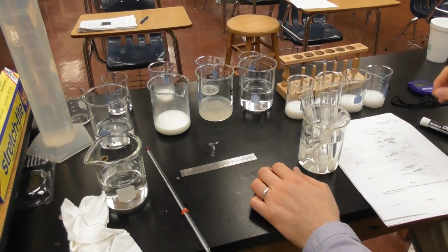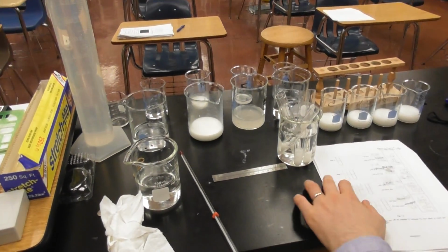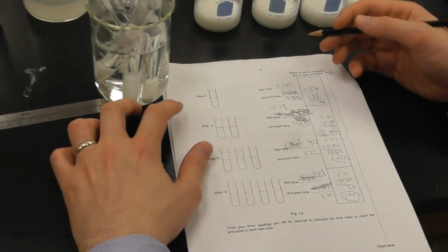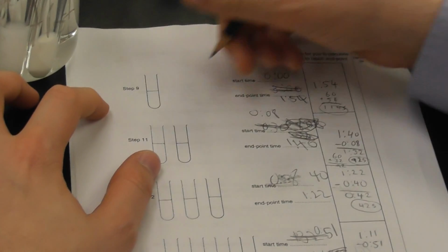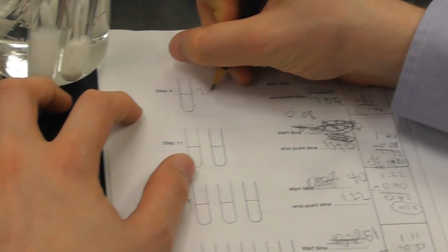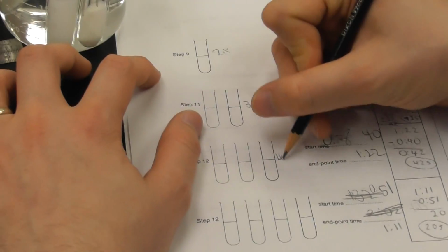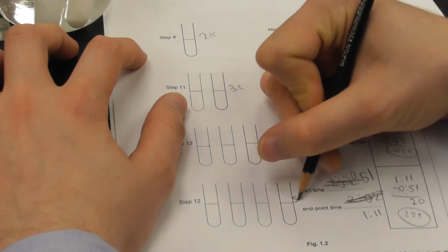Now, I had to cross out a couple of things, and this got a little wet here, so there's some crossed out. I started my 2%, my 3%, my 4%, and my 5%.